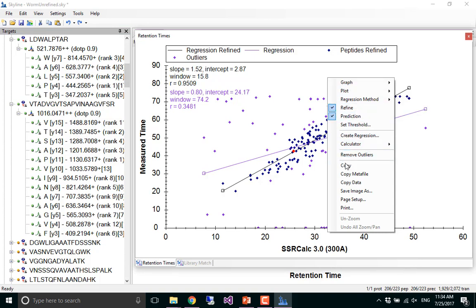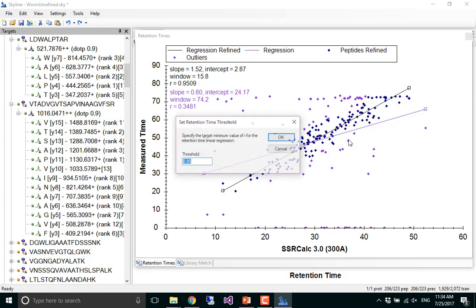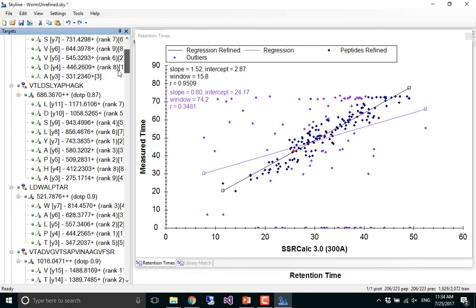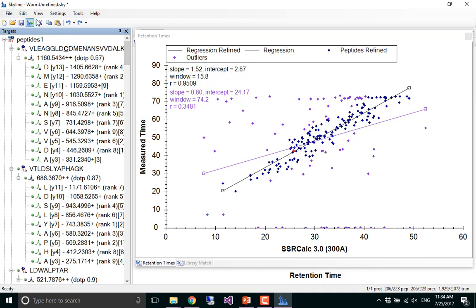Okay, so how about this? Let's look at set threshold. Is everybody at 0.95? 0.9. So switch to 0.95, which will sync you up with me. I think that's a big difference. That's the big difference, is 223 versus 225? I deleted 2.